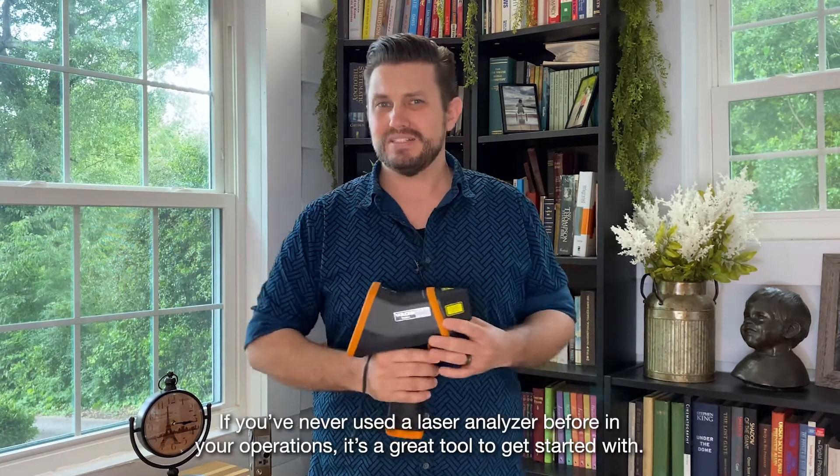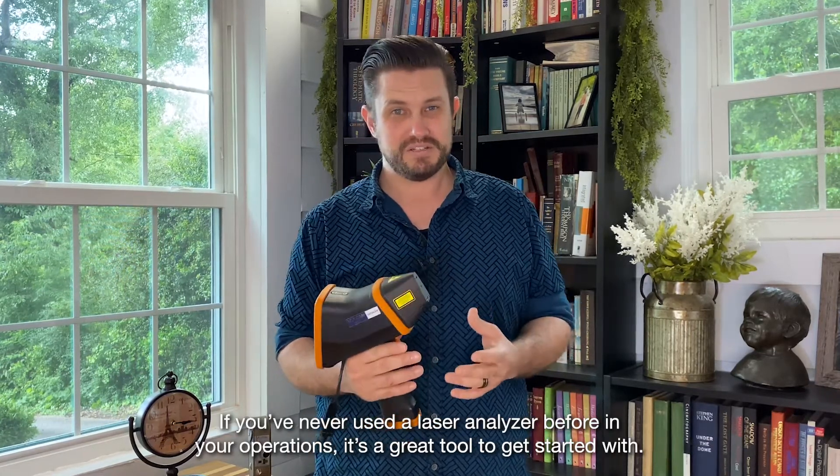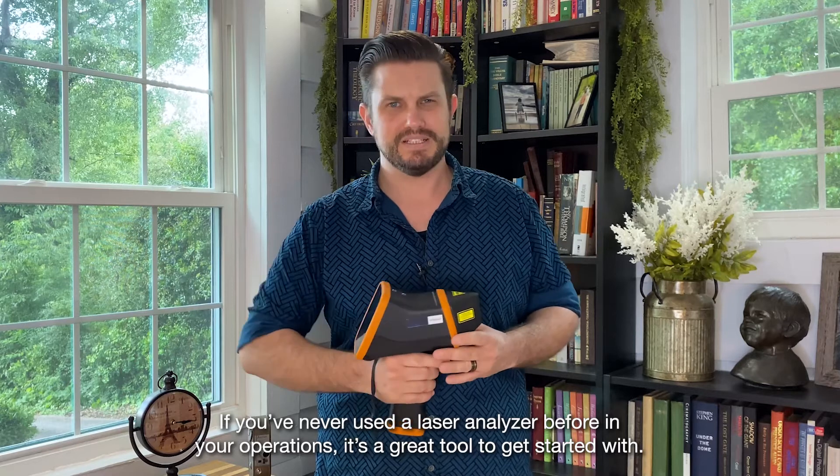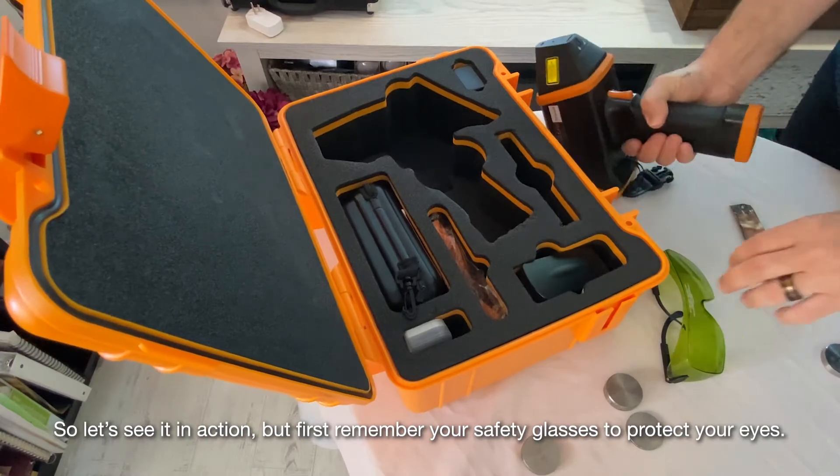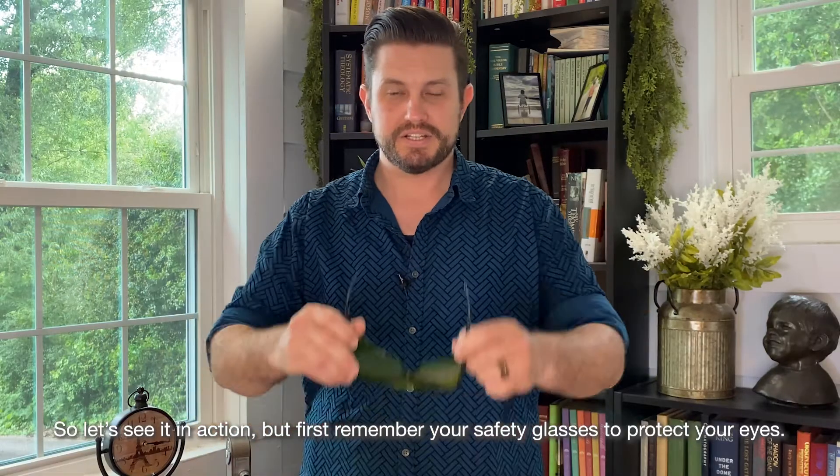If you've never used a laser analyzer before in your operations, it's a great tool to get started with. So let's see it in action, but first remember your safety glasses to protect your eyes.